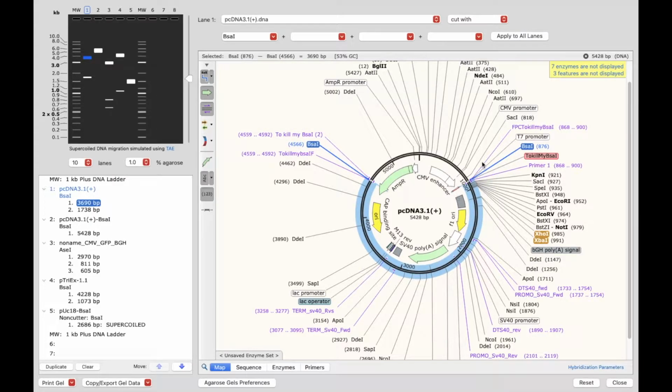So if I get 1 cut here and 1 cut here, I'll have 2 fragments. And this will tell me that the plasmid that I wanted to insert, my plasmid, is the right one. This won't tell me for sure, however, the chances are pretty high that I got the right plasmid here.